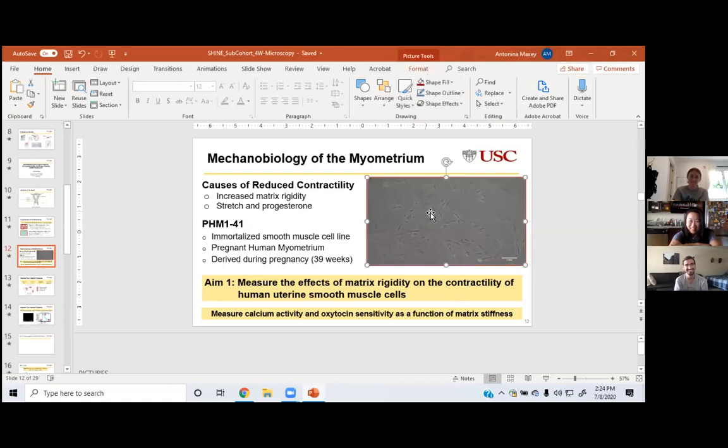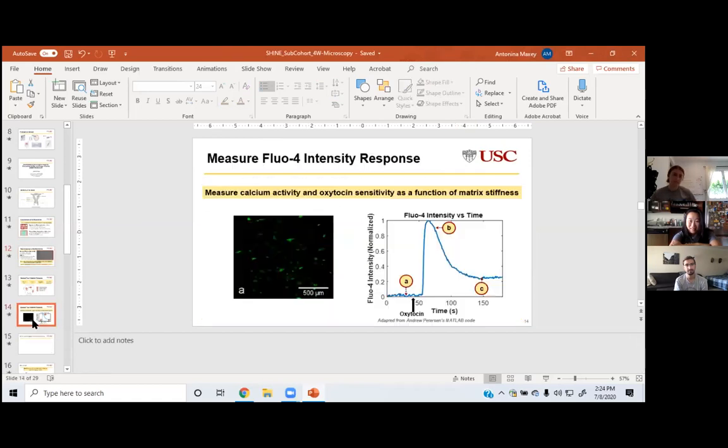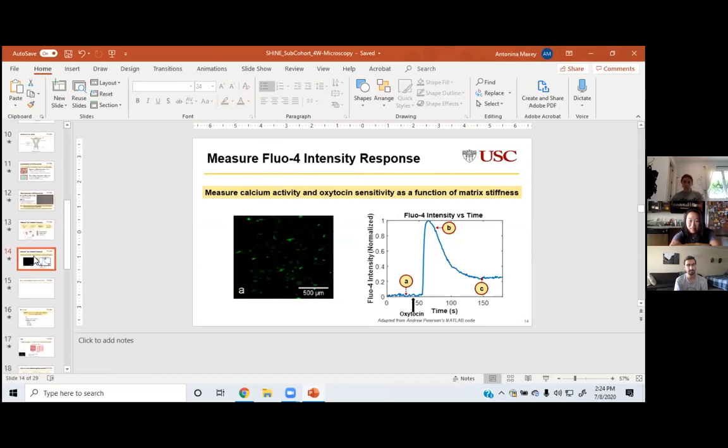This one is bright field microscopy, and then I was able to use fluorescence microscopy here. Those are just two examples of microscopy techniques, and I'm just going to talk a little bit about how microscopy can help you gather data, how it can help you to quantify what you're looking at.